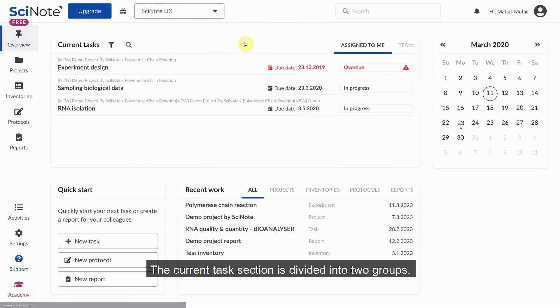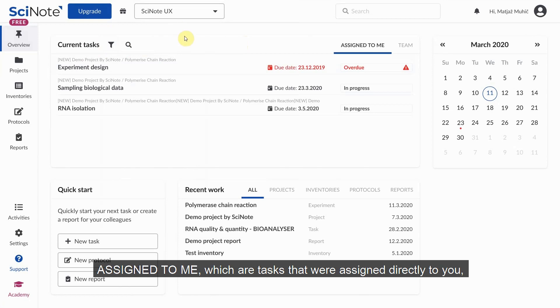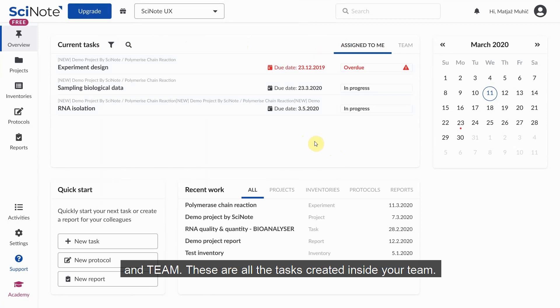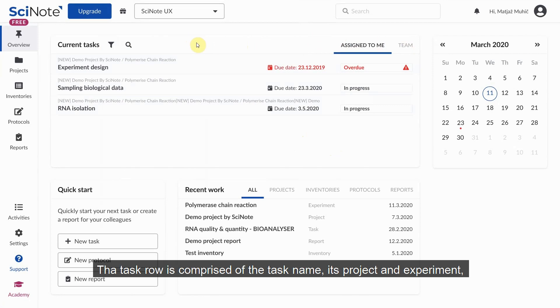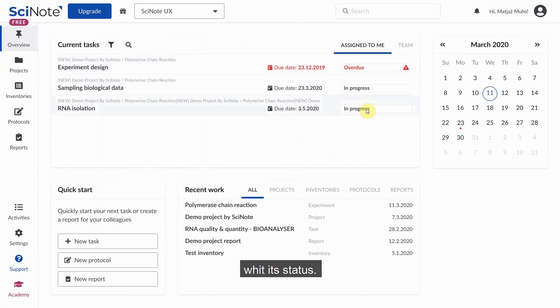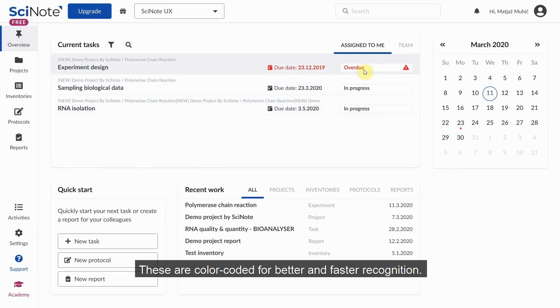The current task section is divided into two groups: Assigned to me, which are tasks that were assigned directly to you and that you are currently working on, and Team, which are all the tasks created inside your team. The task row is comprised of the task name, its project and experiment, when the task is due, and how you are progressing through the task with its status. These are color coded for better and faster recognition.